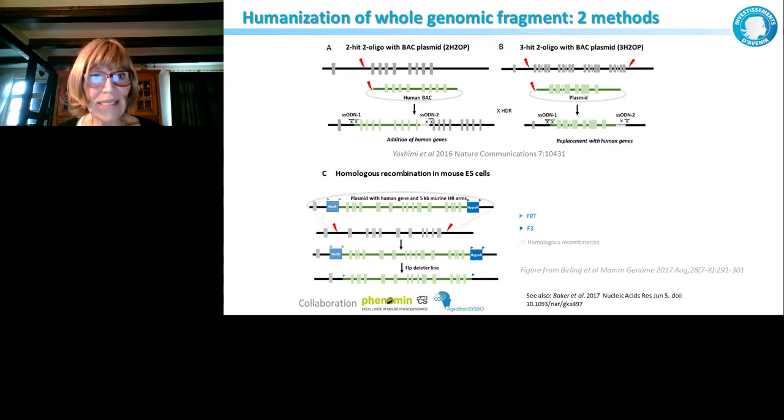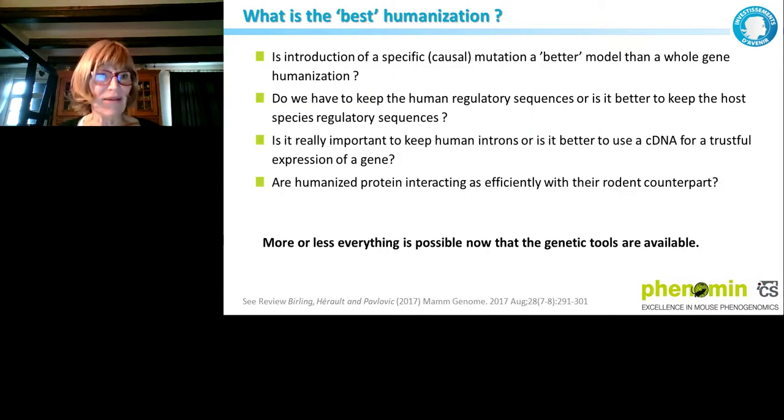And then homologous recombination in ES cells allows us to obtain the same kind of thing in more or less the same timing, perhaps a little longer, but at least we can validate everything very well in ES cells, whereas you cannot do that if you obtain animals directly, and you have to breed animals.